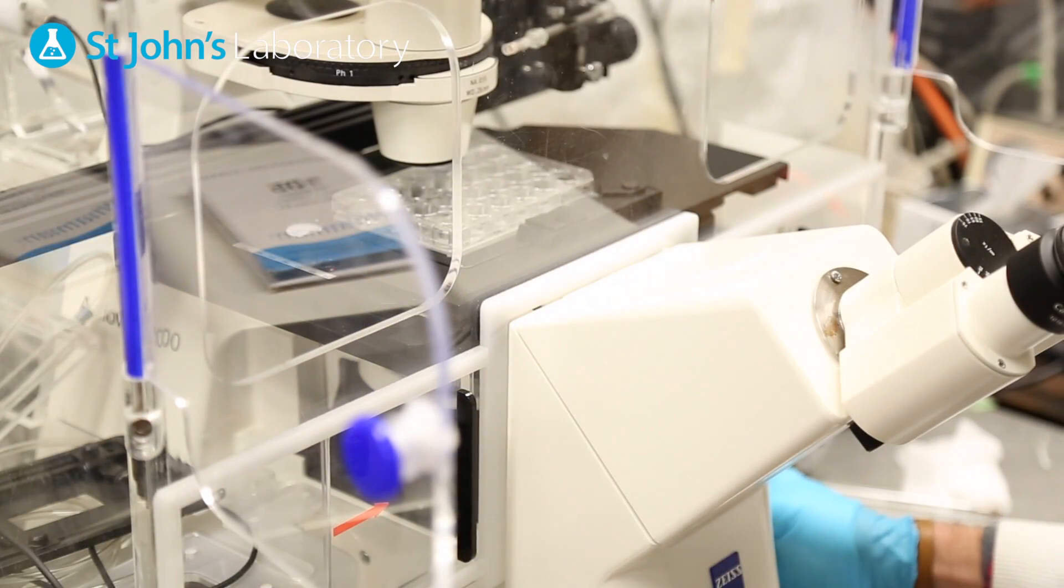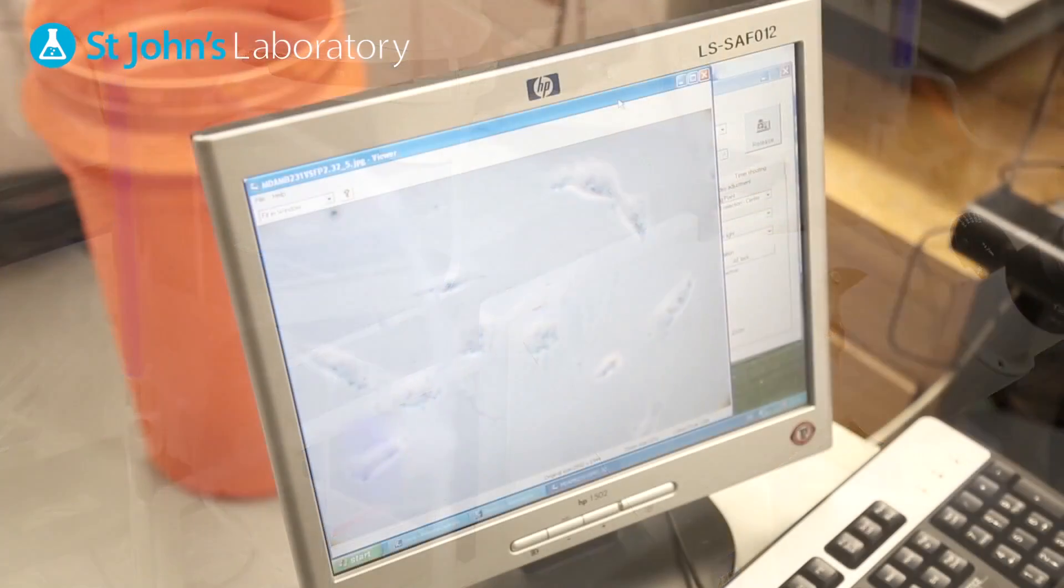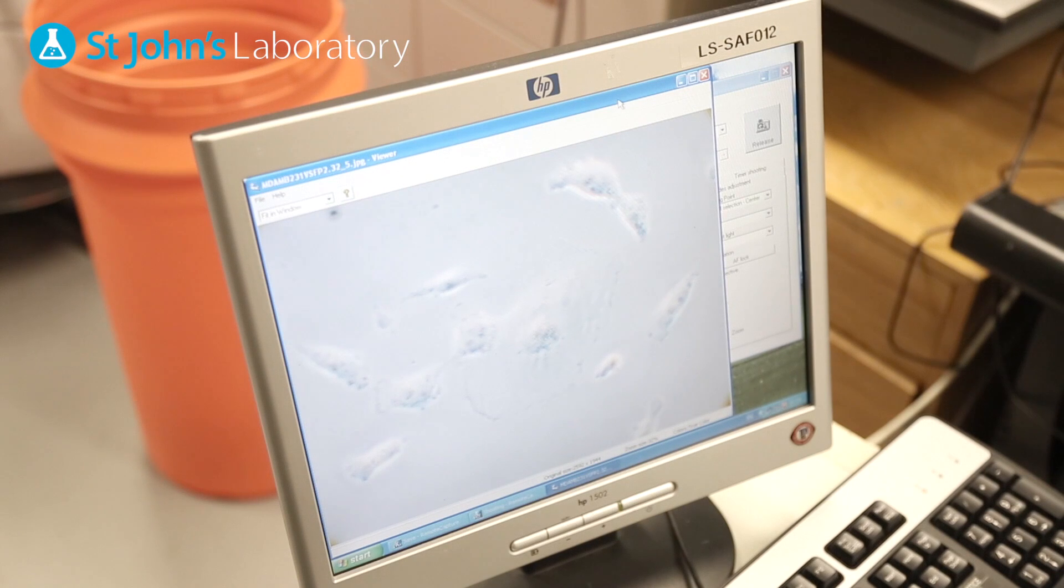Once the cells are fixed remove the paraformaldehyde and visualize each well under the microscope monitoring for any changes in the monolayer.